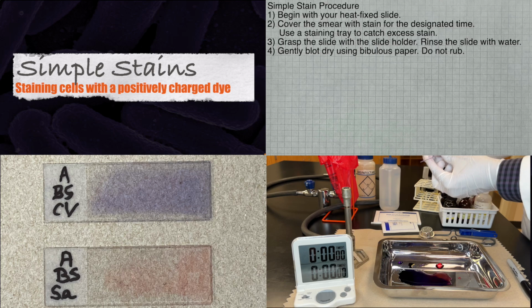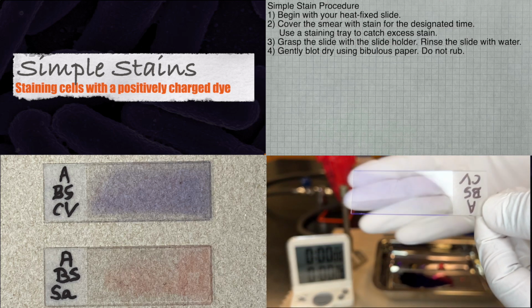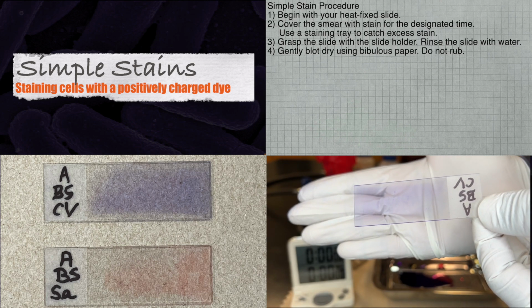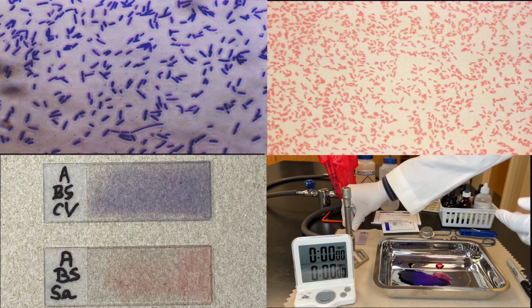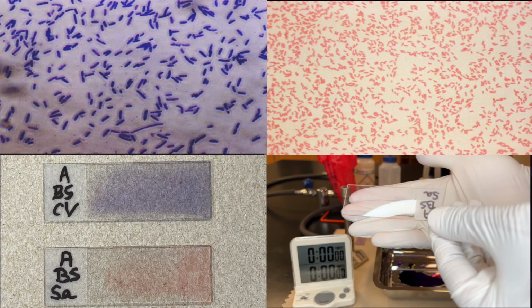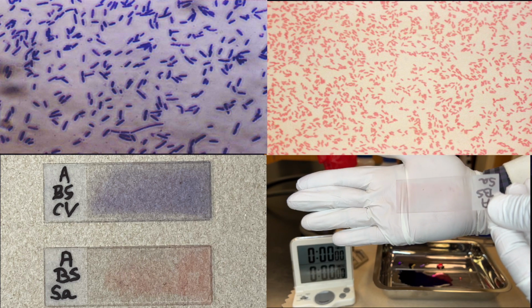After the slides have been made, when you're viewing them with your naked eyes, they should look something like this. Your next step will be to examine your slides using a microscope. If they've been properly prepared, they should look something similar to these images.